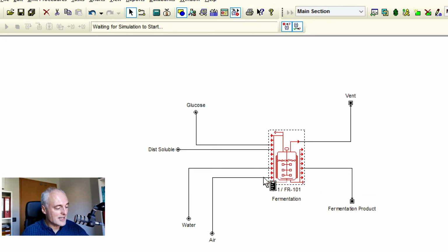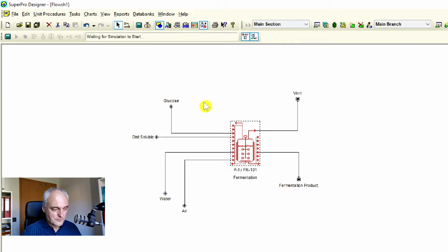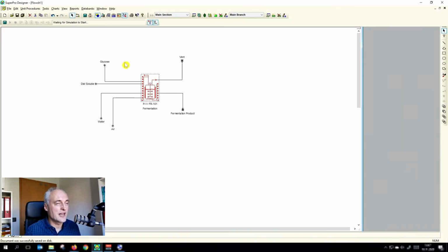Up to now, again, nothing new. This is the same as we have done with the neutralization process, just with another operation. It's a fermentation, no longer a reaction. And second, what we have also introduced is this heat operation to heat everything up. So now we need to initialize the operations.